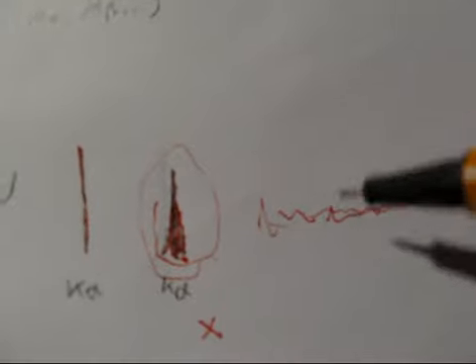That will be just a continuous spectrum of Bremsstrahlung, which I told you before. Then you may have peaks like this, and like this. You may have another peak here, and another peak here, and you just have to find out what kind of elements could be responsible for those peaks, if there are multiple elements, or if these are peaks from the same element.